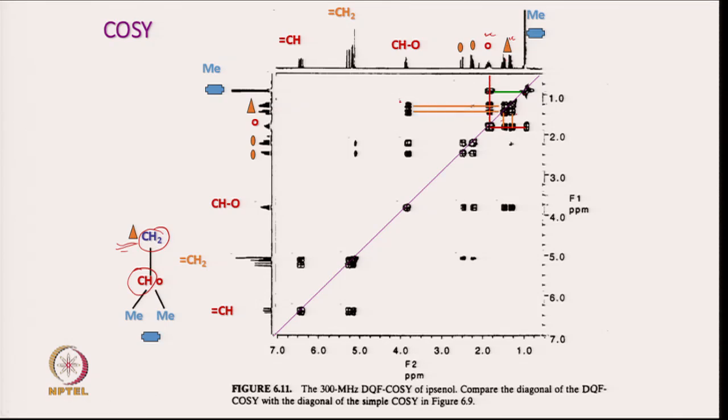Now, you see this is correlated to these two peaks, and is also correlated to CHO. So that is what is correlated, and so it is now quite easy to assign peaks which were difficult to assign by 1D NMR. So, till now we have already assigned.